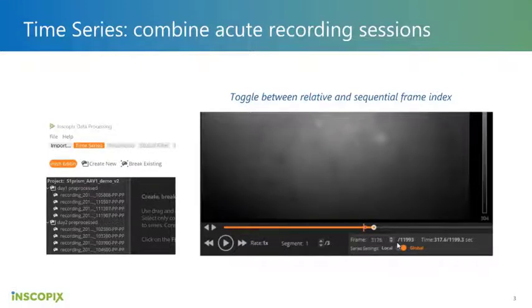Yeah, sure. That's great. I only used TIFF files for an old system, and I used to analyze them not in IDPS but with our own pipeline in QuantSnap. There, the timestamp is not so important, because we always know for each frame how long it is, so you can always recreate the time series at any time point.